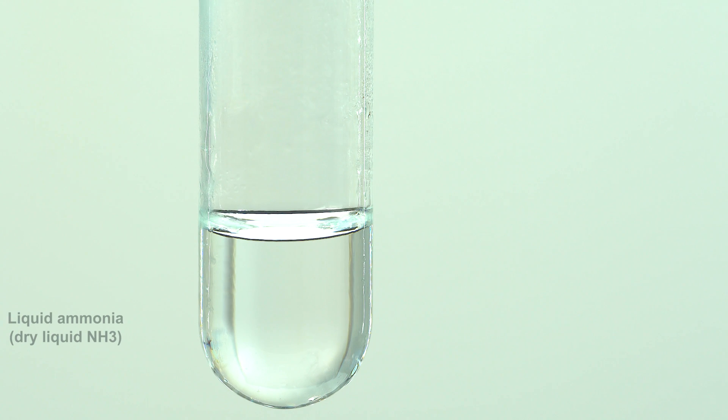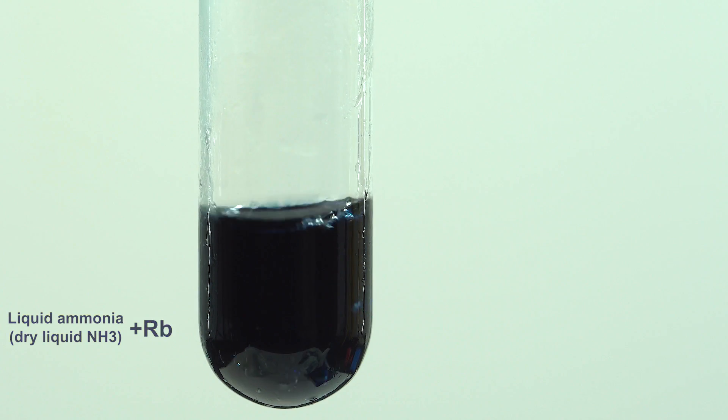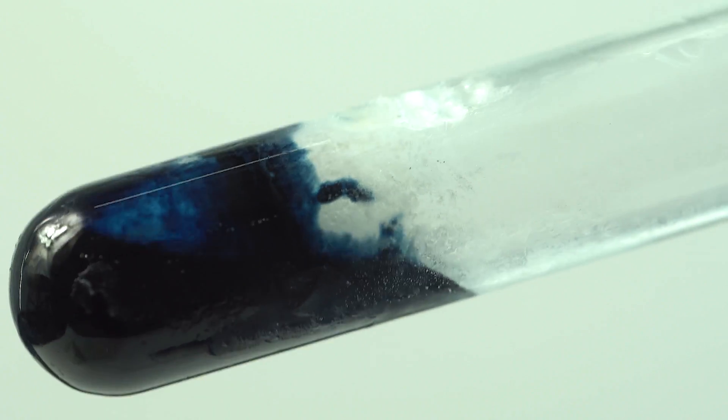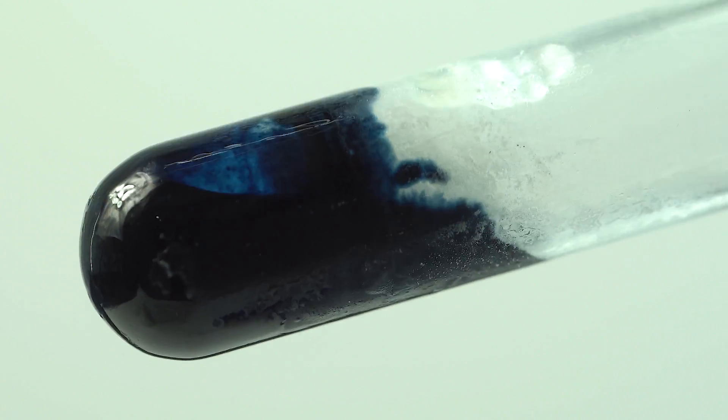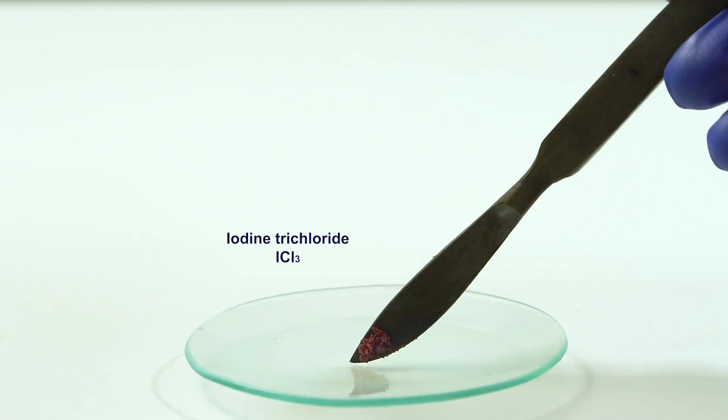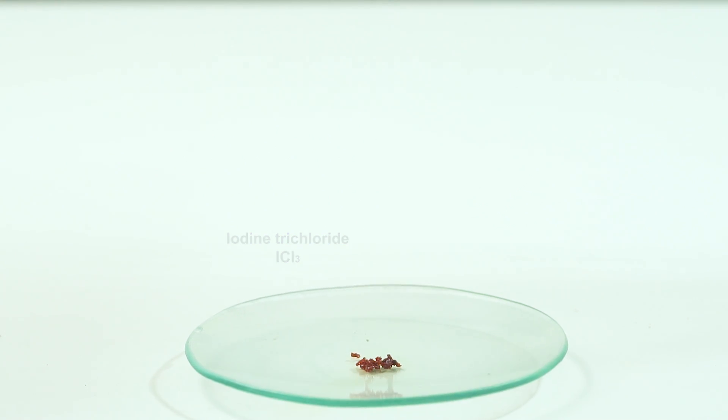As well as other alkali metals, rubidium is freely soluble in liquid ammonia, forming a blue rubidium solution that carries strong reducing properties. For example, it instantly reduces iodine from iodine trichloride, which my previous video was about.